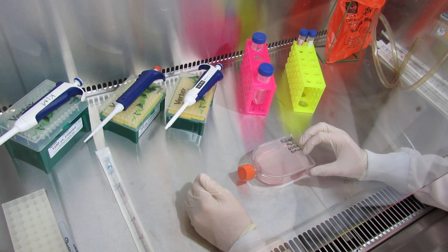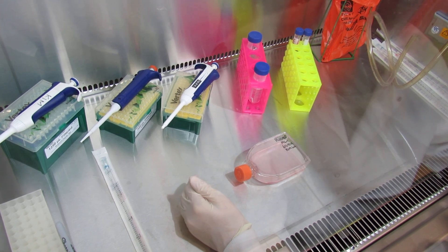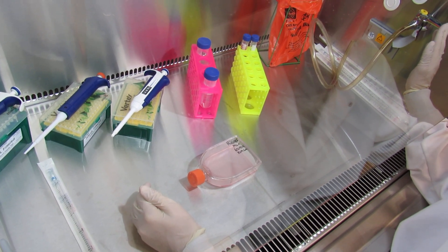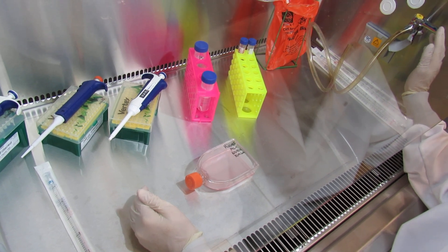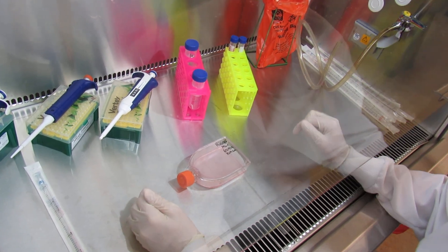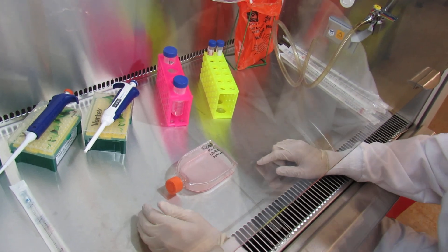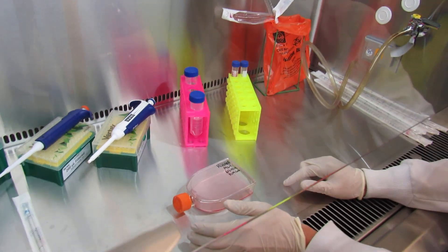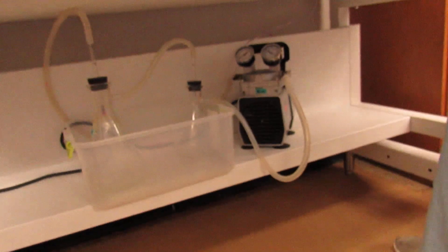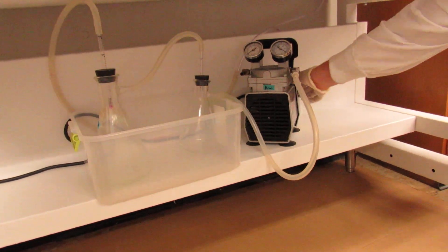To begin, we're going to suck out all of our old media using our vacuum, and then we're going to do two steps of PBS washes. To start, you're going to want to turn on your vacuum, which is located below the biosafety cabinet. As you can see, we'll turn it on by flipping the on switch here.